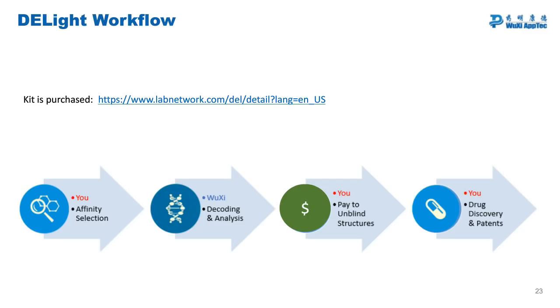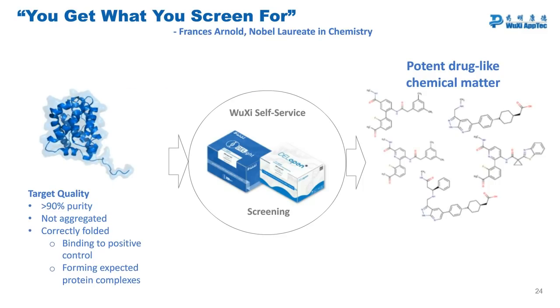So there might be some of you online who discovered a great protein 30 years ago, and it's been sitting in the back of the freezer waiting to be screened. And the question is, is it a good idea to take that protein out of the freezer, let it warm up to room temp, and run a Dell screen on it? And there's been a fair amount of historical data that would say that that probably will not work out well.